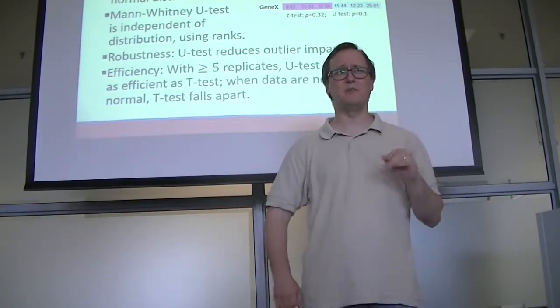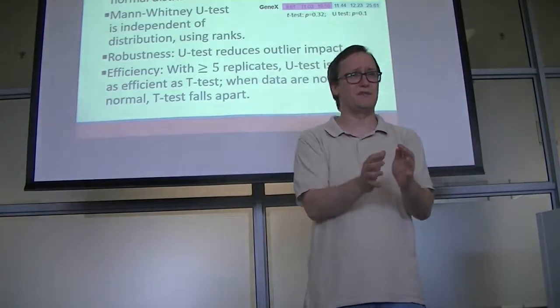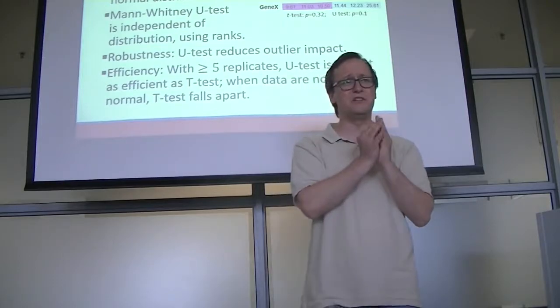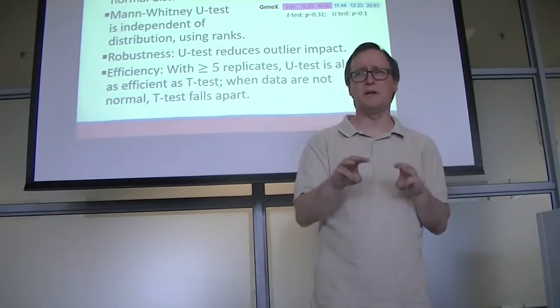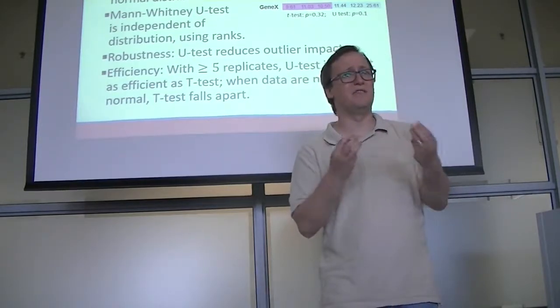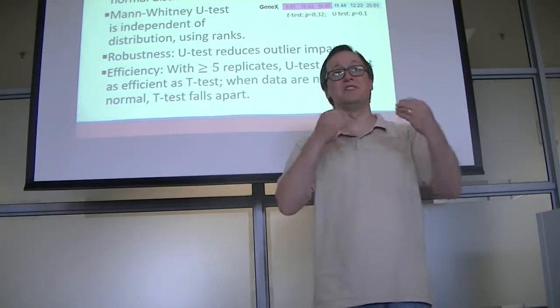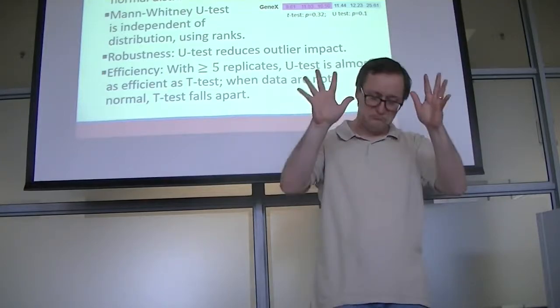I'm just going to point this out for a moment. Professors, we're cheap, right? We have limited amounts of funds for stuff, and we try to get by with the smallest experiment we possibly can. As a result, at some point in your career, you're going to be pressured to do an experiment with a 3-on-3 comparison without knowing whether that's got enough power to give the answer you want. If you always argue for 5 replicates rather than 3, there's a lot more times when you're going to be able to discover differences just because you have more power in a 5-on-5. All right, I've said that.